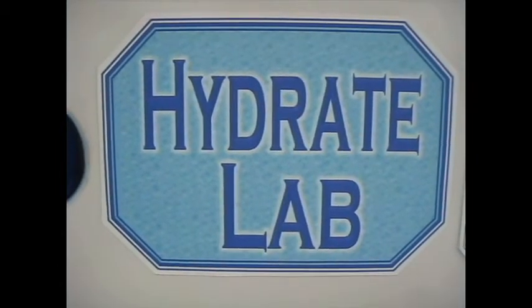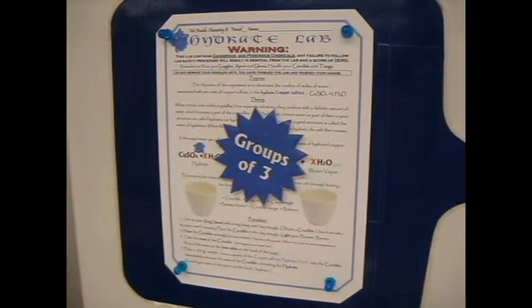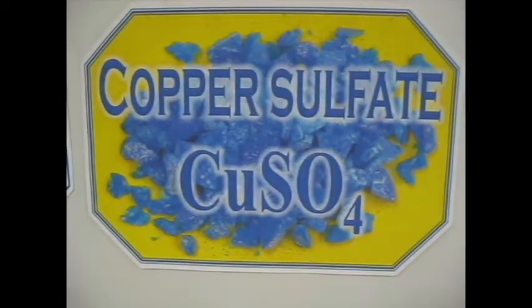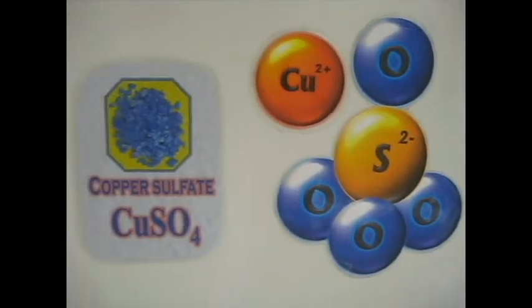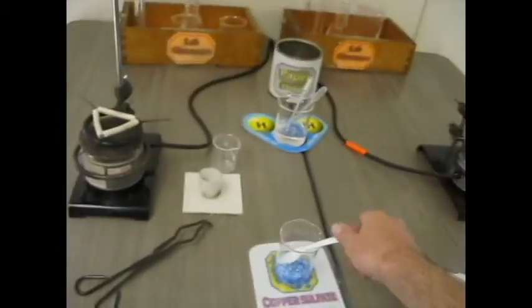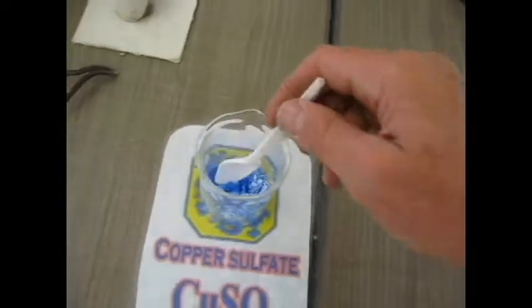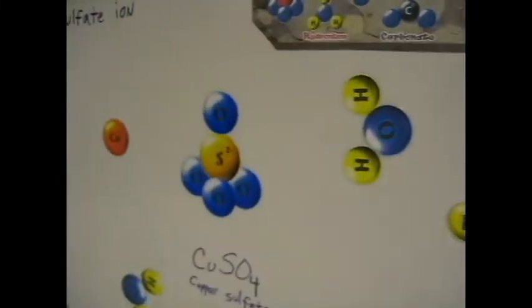All right, the Hydrate Lab. We are going to be using a beautiful blue chemical called copper sulfate, CuSO4. Beautiful, beautiful blue chemical, which is located in these beakers. There it is, the beautiful copper sulfate. Okay, copper sulfate. But the problem with copper sulfate is that it's not really blue.